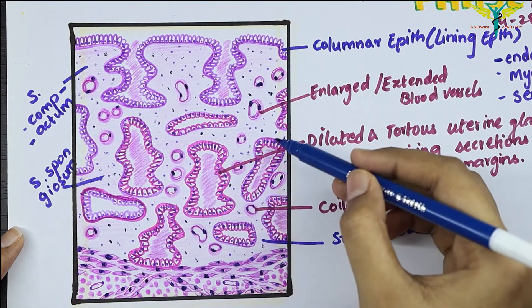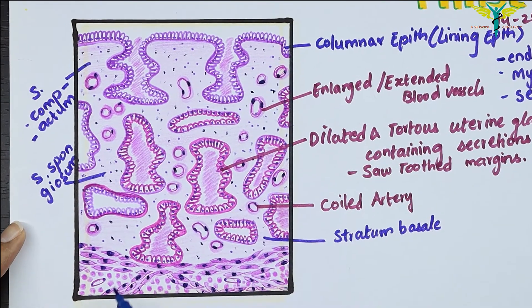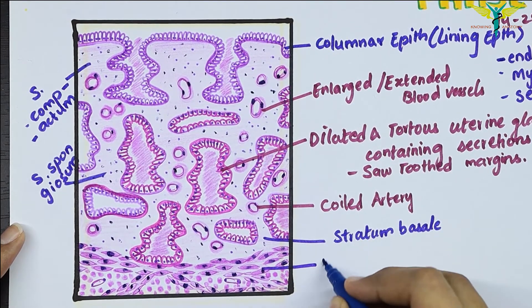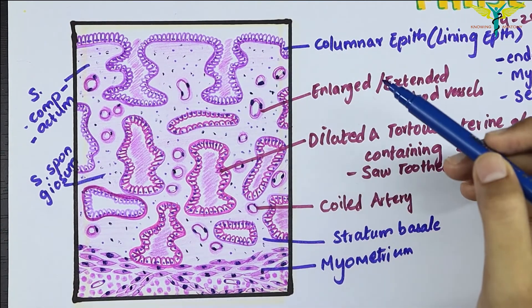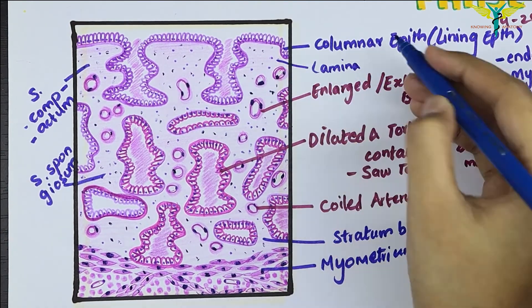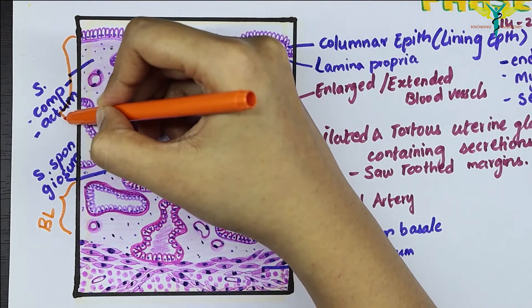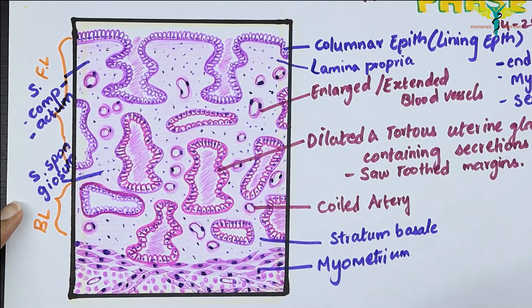You can see the enlarged uterine glands here, and these are the secretions. This is the myometrium layer, which contains many smooth muscle cells and some arteries inside. This whole area is the lamina propria of the endometrium, and this is the basal layer, whereas from here to here is the functional layer.